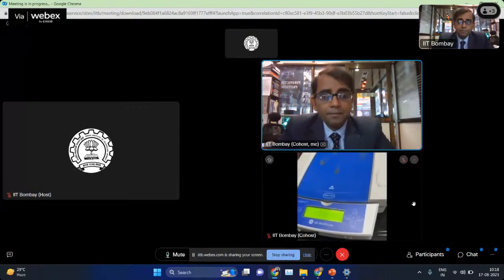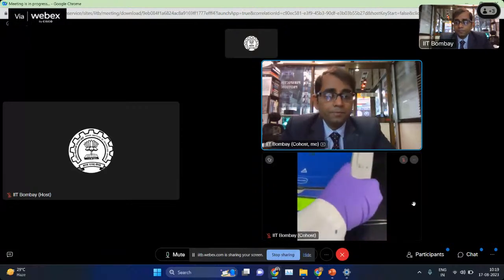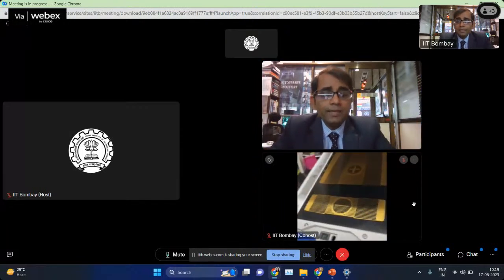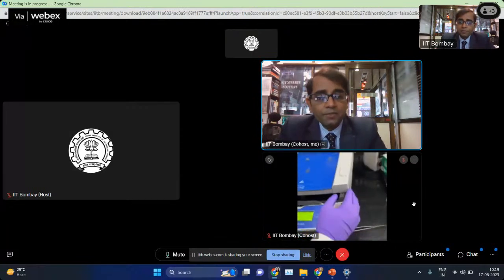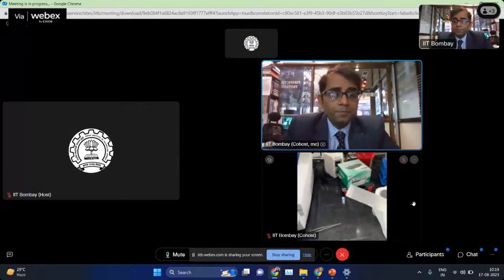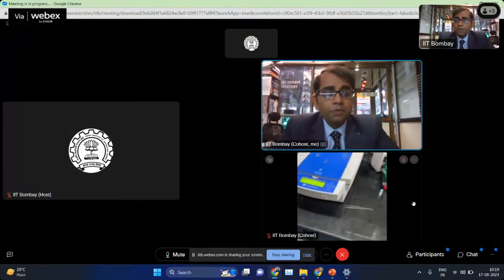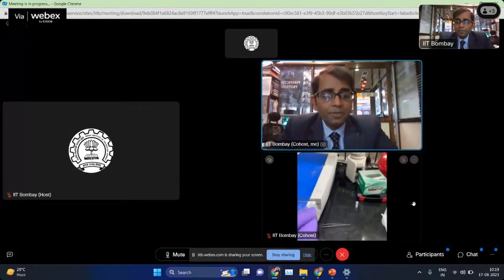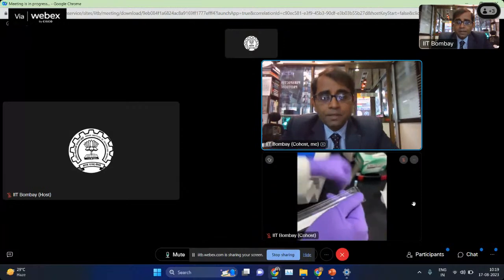Can we see the setup for the tray, please? So, of course, this is the bed of the IEF, but if we have the tray of the isoelectric focusing unit, that's where we keep our IPG strips. And the very first thing which you have seen, you'd like to take out these IPG strips, immobilized pH gradient strips, which come in different lengths.